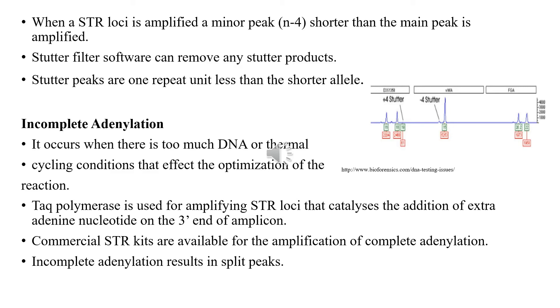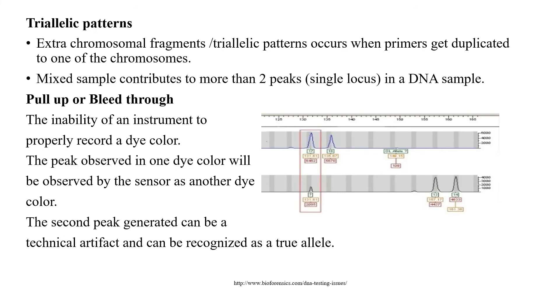Triallelic patterns or extra chromosomal fragments occur when a primer allele gets duplicated in one of the chromosomes. A mixture sample contributes to a DNA profile resulting in more than two peaks in a locus — this is called a mixture sample.